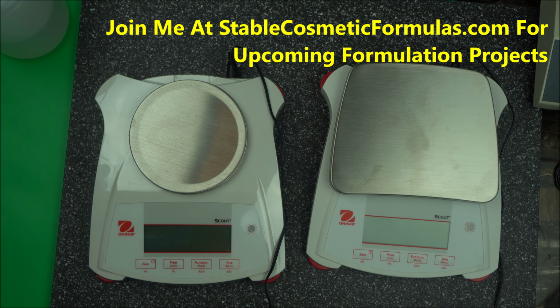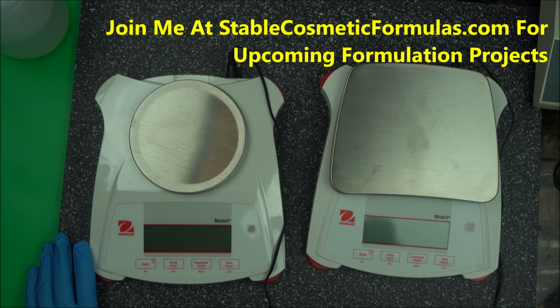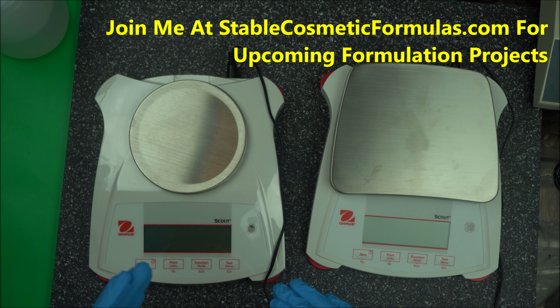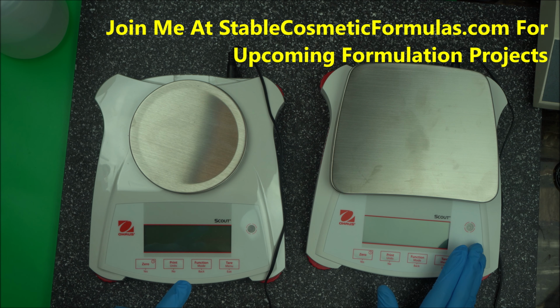In this video I'm going to tell you the best type of scales that you should have in your home lab or cosmetic formulation lab. Number one thing is that you have to be careful of regular scales that are on the market. I've been trying to make this video for a while, but today I'm taking advantage of the opportunity to inform you all. So in every lab you should have at least an electronic scale. You ask me, why do I need an electronic scale? Before I talk about it, let me talk briefly about the two types of scale that are very popular in the lab. Number one is the analytical precision scale.